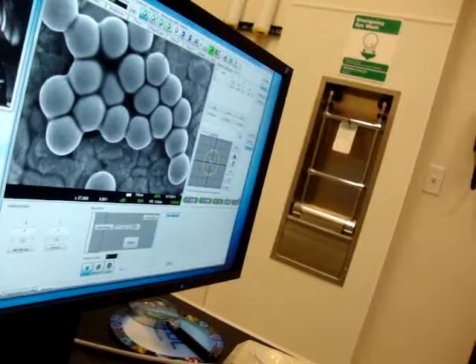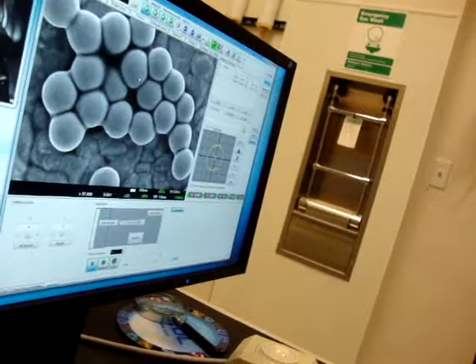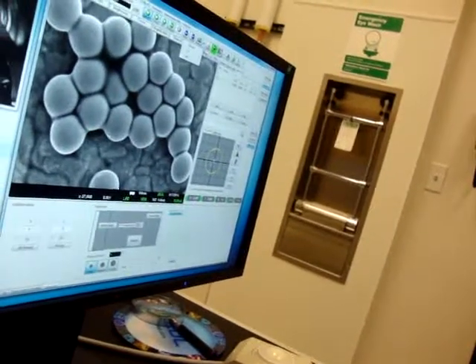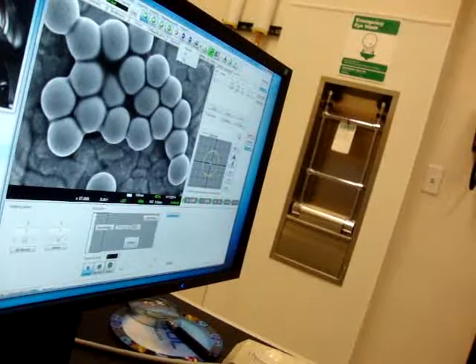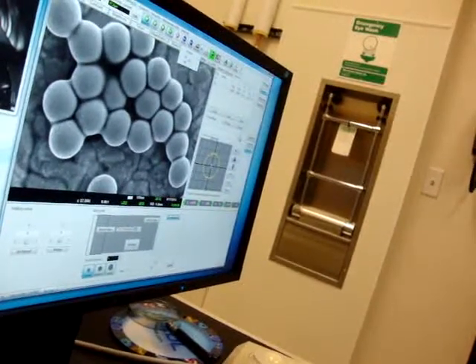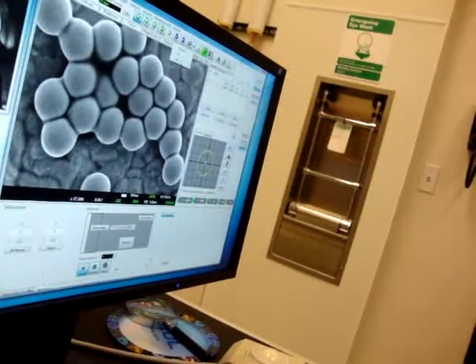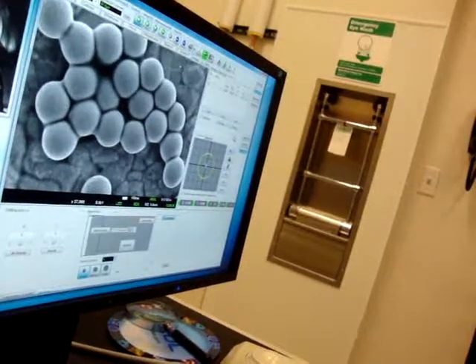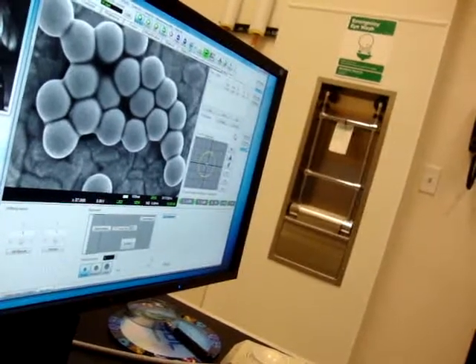So freeze has multiple functions. But usually we don't have to freeze. You can just do photo. Photo has multiple photo speeds you can choose from. There's normal, CF, and HD. You can have slow, faster scan speed, what have you. Some people don't like to sit around, but the slower you take your picture, the better it's going to be.